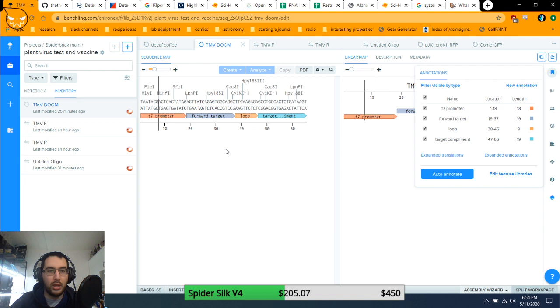And RNAs, I have functionally infinite supply because I have like a gram or two of it, and you need nanograms for it to work. But yeah, if I have any other viruses, it's a $20 fix, and I can just whip up a quick batch of vaccine again, spray it down, call it a day. And I don't even need the PEI, technically. I could just spray the plants with the pure RNA. The PEI just makes it more effective. I could also inject it into the plant. There's all sorts of different ways that I could do it. But the point being, it's basically a $25 fix.